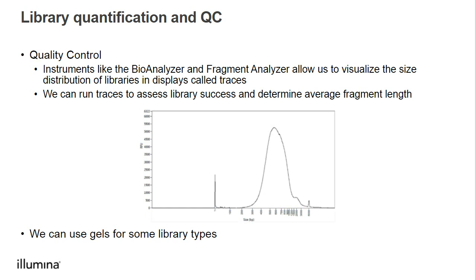For some library preparation methods, gels can alternatively be run to visualize the libraries. We periodically have a webinar for library QC and troubleshooting with the Bioanalyzer, and this webinar is super informative. I definitely encourage that you attend if you would like any additional information on traces and reviewing them. And then, of course, if you ever have any questions about library traces or would like to review them together, you can always reach out to technical support.